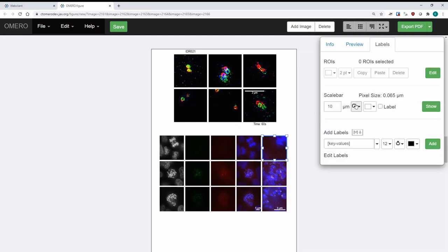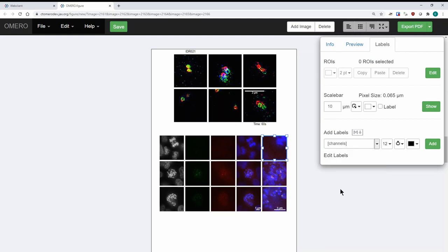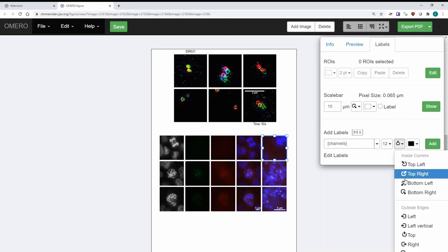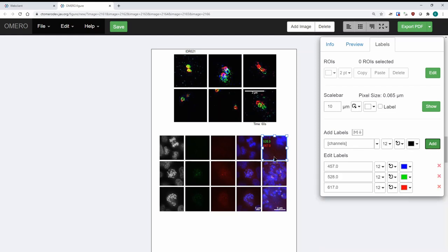A few more things you can do here: you can add labels based on the channels. I can press 'Channels' and add — instead of putting it on top of the image I'm going to put it on the top-left inside corner. You see it gives me the wavelengths of each individual channel, but essentially whatever you have set as the channel names is going to appear here with the correct colors and everything.